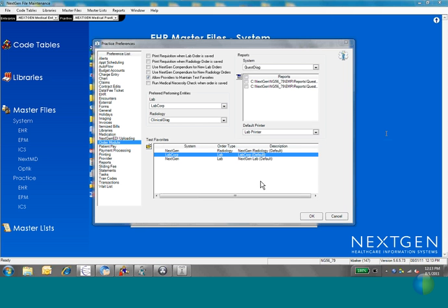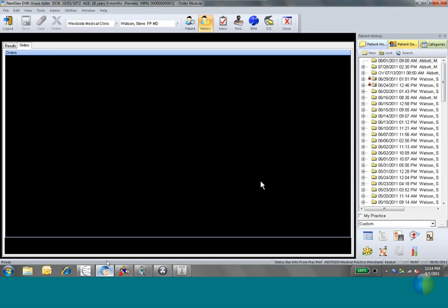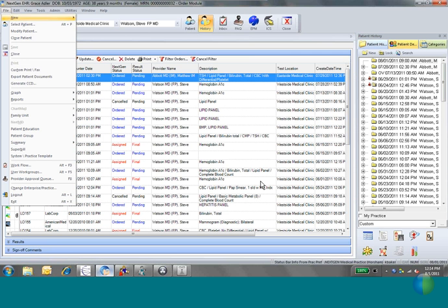Question on the board. Do you link your requisition and your result report here? The answer to that is just your requisition. Just your requisition and labels. The results reports, you don't link them here because you're going to open them up from a different place in the EHR. Result reports are done usually through the File menu under Reports and then Crystal Reports. So therefore, you don't have to do any file maintenance linking in that case.